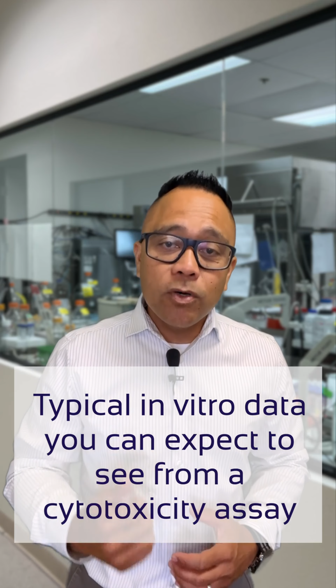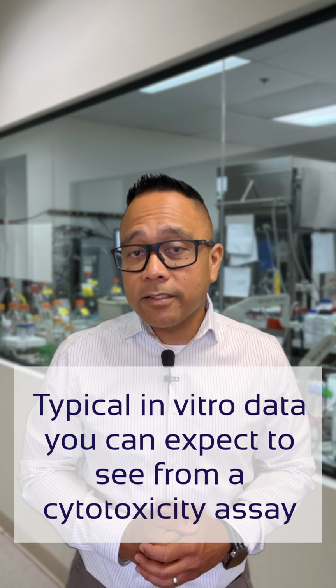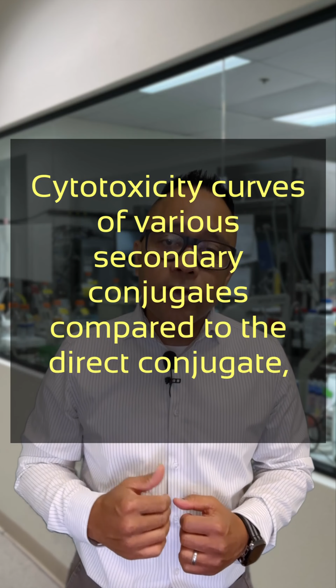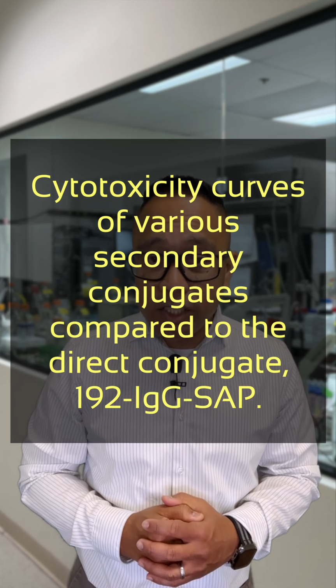Today, I want to finish off our topic of ZAP conjugates with a closer look at the typical in vitro data that you can expect to see from a cytotoxicity assay. So, in this example that you're looking at, you're going to see cytotoxicity curves using various secondary conjugates compared to the direct conjugate 192 IgG SAP.